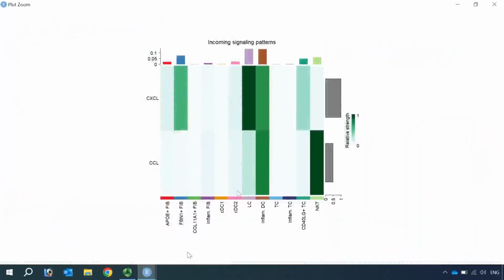You can see now the ERC cell type express high level of the CXCL receptors, and the NKT cell express high level of the CCL receptors. So from the ligand and the receptor expression, you can see the CXCL signaling pathway is a paracrine signaling pathway, but the CCL signaling pathway is an autocrine signaling pathway on the NKT cell types.